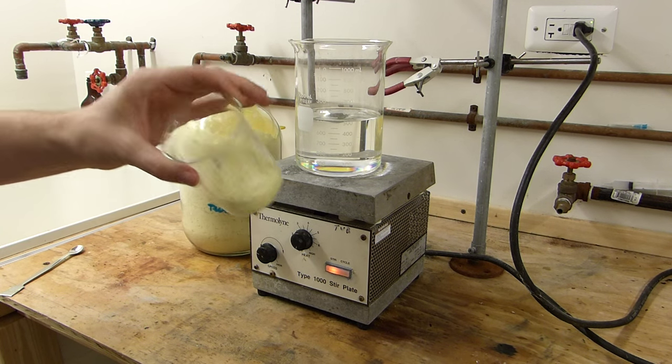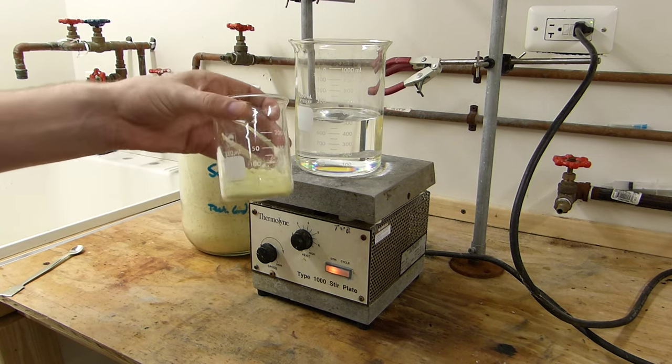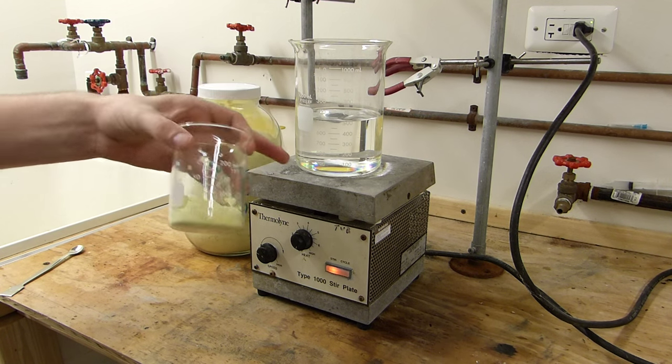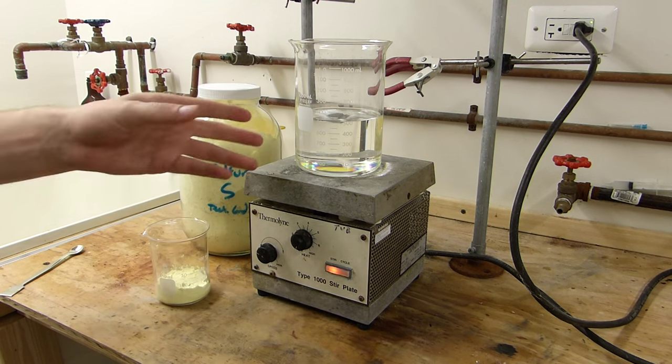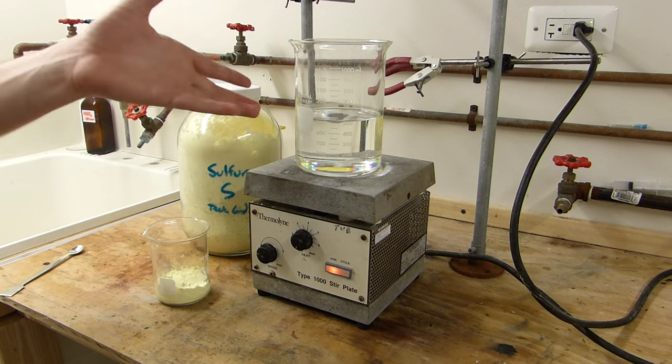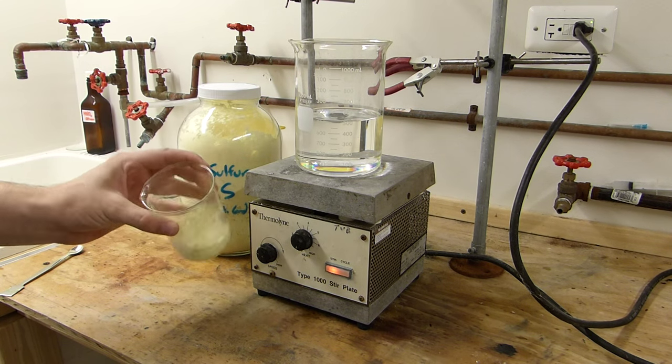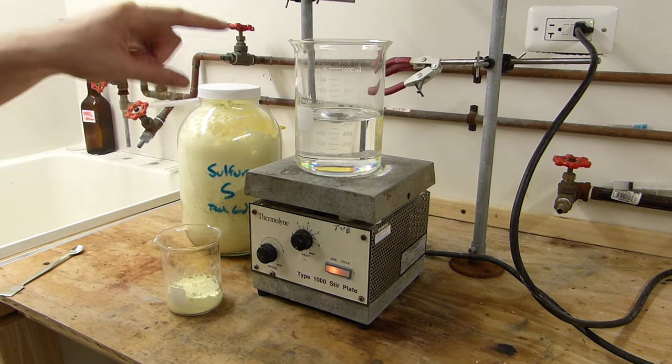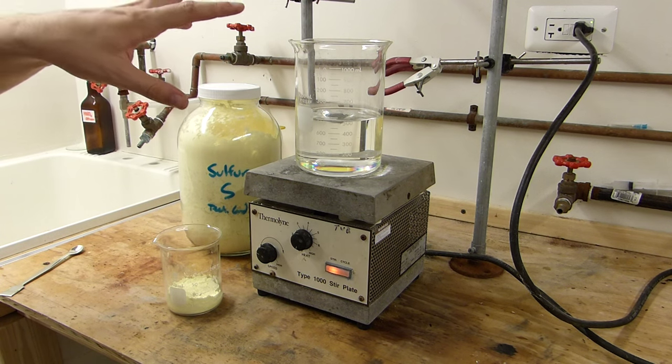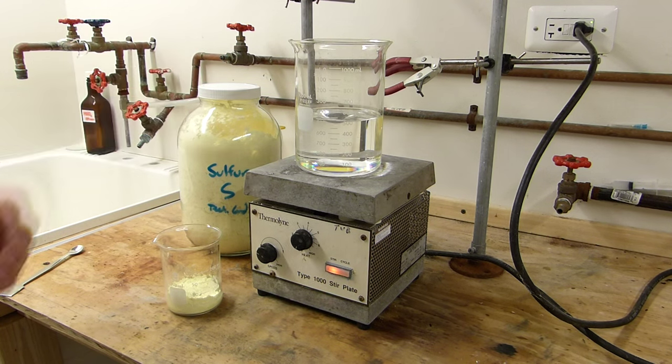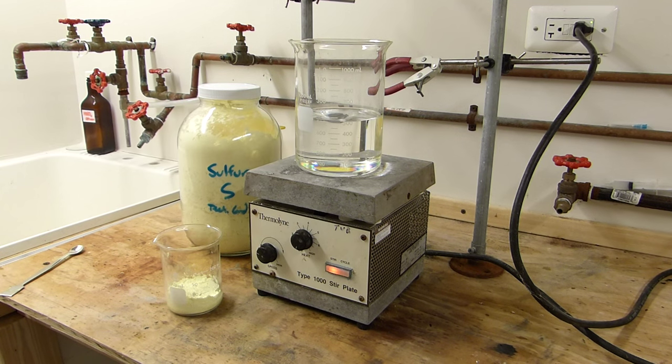So the plan is to simply add 50 grams of impure sulfur to the xylenes, heat and stir until all of the sulfur is dissolved, and then we can filter the solution to remove some of the impurities that are not soluble in the xylenes, and then we can allow the sulfur to crystallize back out after putting it in the refrigerator.